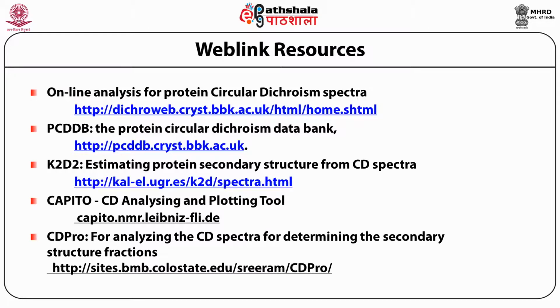Another server is the PCDDB, the Protein Circular Dichroism Data Bank, which stores all the CD spectra of well-known proteins. The K2D2 server is used for estimating secondary structure from the CD spectra. Another tool is Capito, which is also an analyzing and plotting tool for CD spectra. And CDPro is used for analyzing the CD spectra to determine the secondary structure fraction present in a protein, once the spectra has been taken.